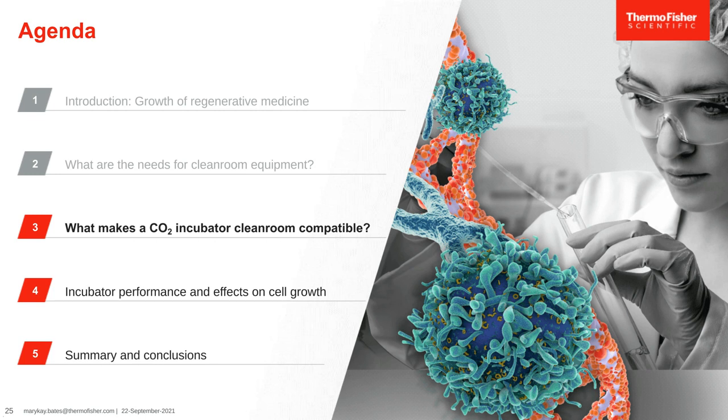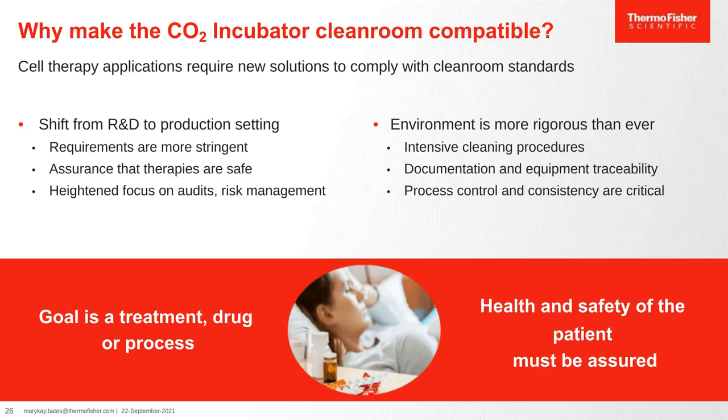So that's a lot about particles in a clean room and why the clean room is different than an R&D lab. And so I hope that this shows you why a clean room is so very much different than a standard R&D lab and why we've been thinking about how to make a clean room compatible CO2 incubator. So now I'm going to talk about what makes a clean room compatible CO2 incubator. And why would we do that?